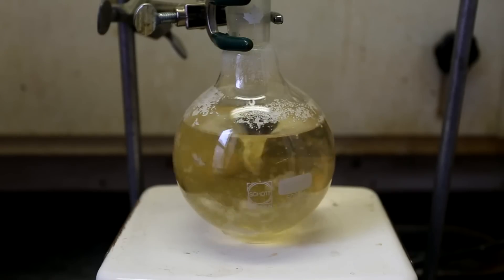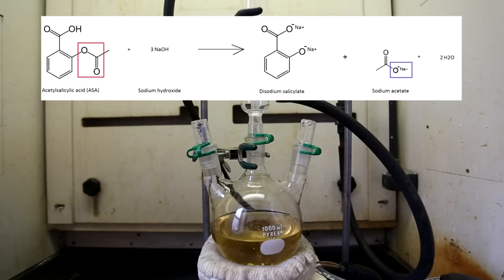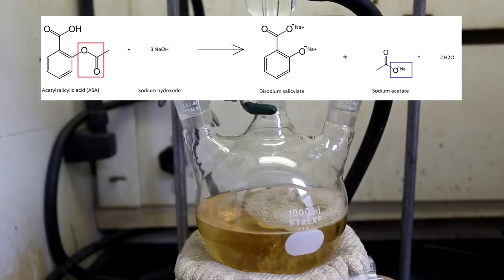This round bottom flask was now too full to carry out a reflux, so I transferred the solution to a large 3-necked 1 liter round bottom flask. Once the solution started boiling, I refluxed it for about 20 minutes. The reaction between the sodium hydroxide and the acetylsalicylic acid is a base ester hydrolysis reaction. The ester in the red box is hydrolyzed by the sodium hydroxide.